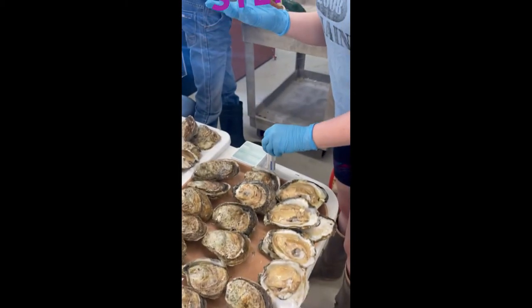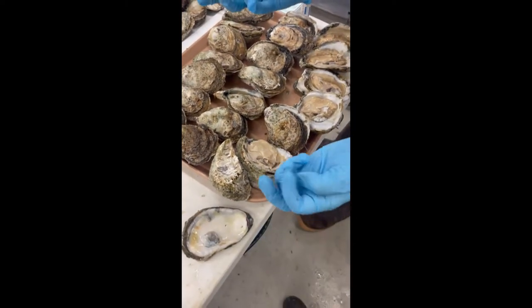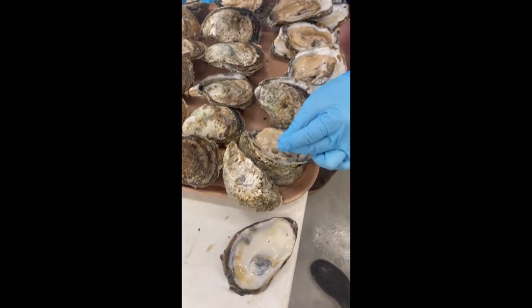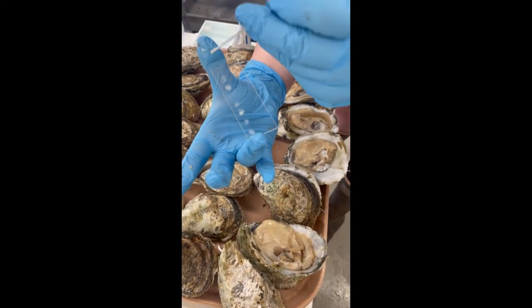Our mentor Brittany Wolf Bryant will be sampling the gonads from each of the oysters. She begins by taking a hollow tube and using it to scoop up the reproductive cells of each of the oysters that we shucked. She then takes some of those cells and puts them on a slide to look at under a light microscope.